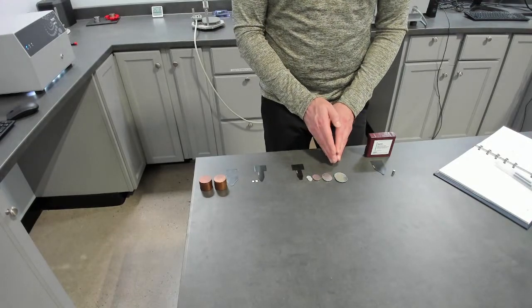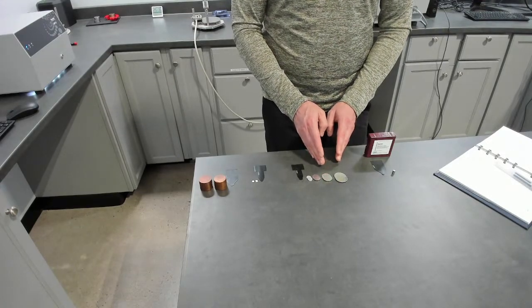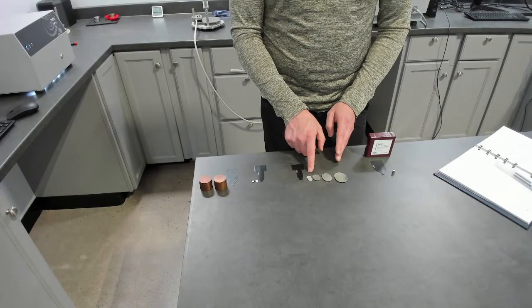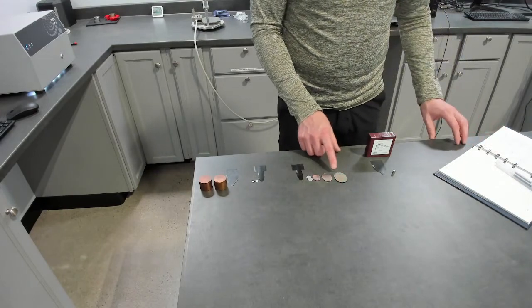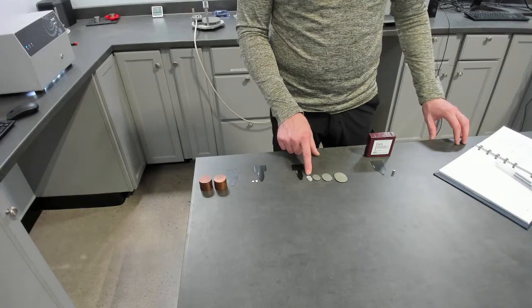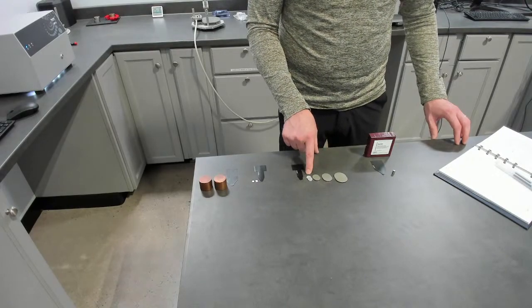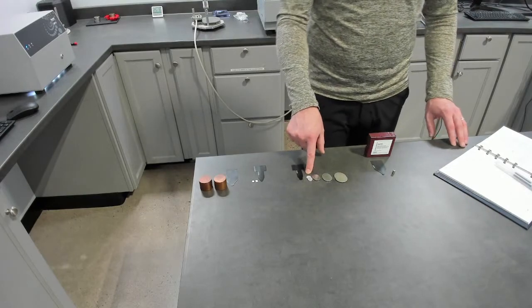By removing points off the back of a 600 point, 0.25 second measurement, we can reduce the penetration depth. So what you'll see from the example here is that although we're doing 0.25 seconds across all of them, ultimately, to keep the heat within the boundaries of the 12.7 millimeter diameter, we had to chop the data down to 0.11 seconds. And that still gave us 200 data points.